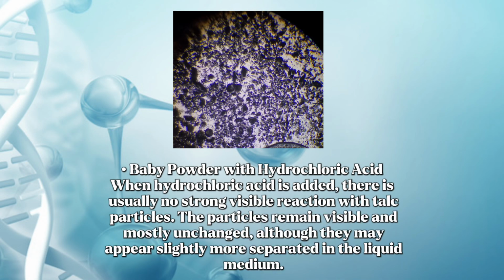Baby powder with hydrochloric acid. When hydrochloric acid is added, there is usually no strong visible reaction with talc particles. The particles remain visible and mostly unchanged, although they appear slightly more separated in the liquid medium.